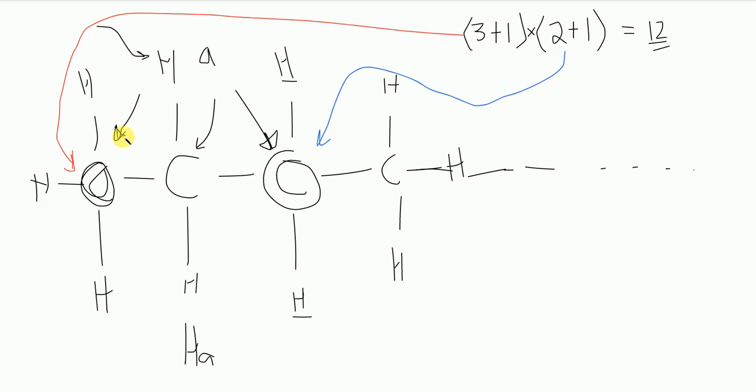And I explain this a lot better in person because you just have to look at it and we look at it. It'll be better towards the end of the video, I promise, where I do some examples. But this is how the first part is going to work. You're going to have this multiplication together, and you're going to look at each unique environment that's surrounding this carbon here with its hydrogens. Okay, and this is going to give us information about the nearby environments.